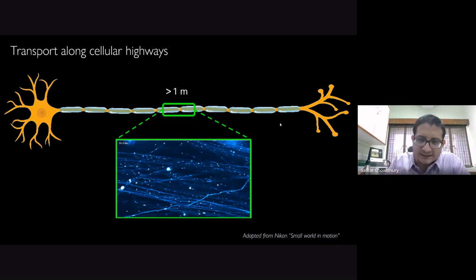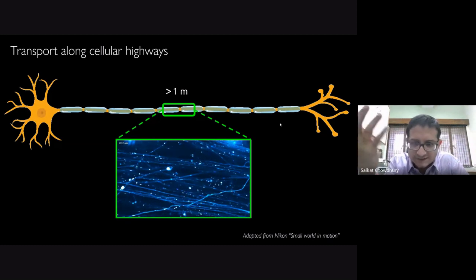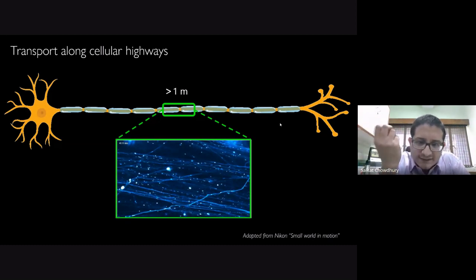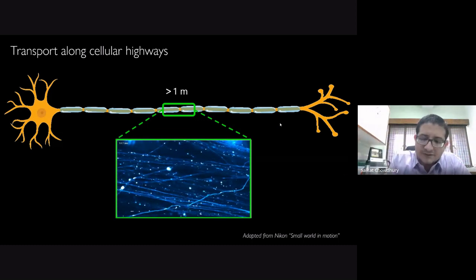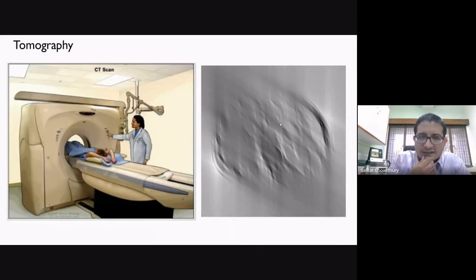And here you can see these little speckles, which are like little spots or dots. Many of us have seen these in movies, in papers or publications. But how do these spots look? What is their ultrastructure? This was not possible for quite some time without the help of EM. And this is something that I did as a postdoc, to understand the structure. So we used a methodology called tomography.